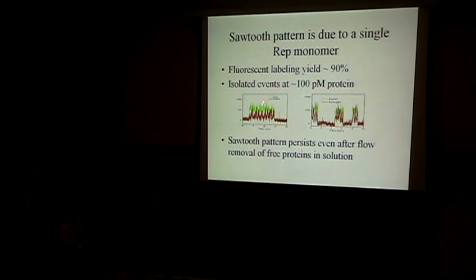So you see binding, repeated translocation that is highly regular, and then dissociation or photobleaching of the donor molecule. Then nothing happens for a while, and then there's another event like that, and later on something happens again, and so on. If you look at the characteristics of each burst, it doesn't depend on protein concentration, but the time interval between bursts depends on protein concentration. Finally, we can also do these measurements while you're taking the movie, and you can use a flow cell to wash away free proteins from the sample chamber.